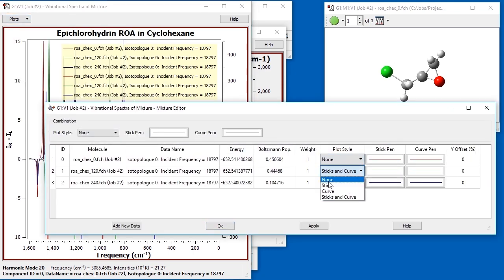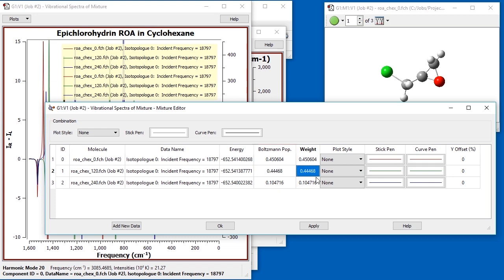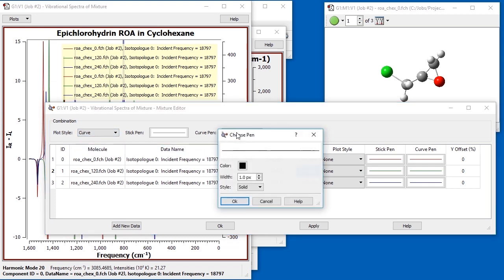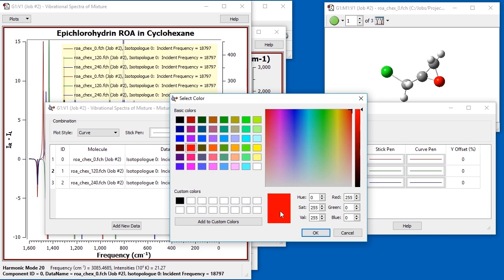We apply weights to the individual spectra corresponding to their Boltzmann populations by selecting the corresponding item on the right-click context menu. Finally, we add a customized combination line to the graph using the controls at the top of the dialog.